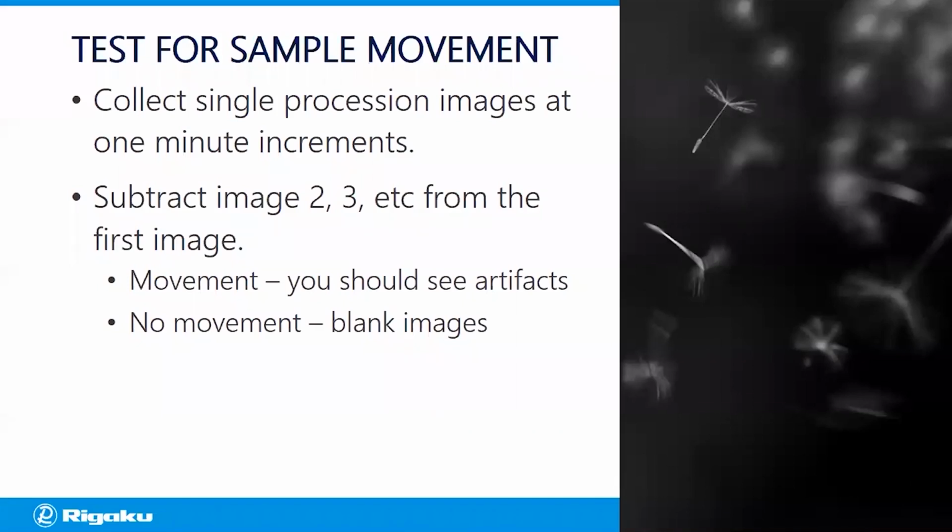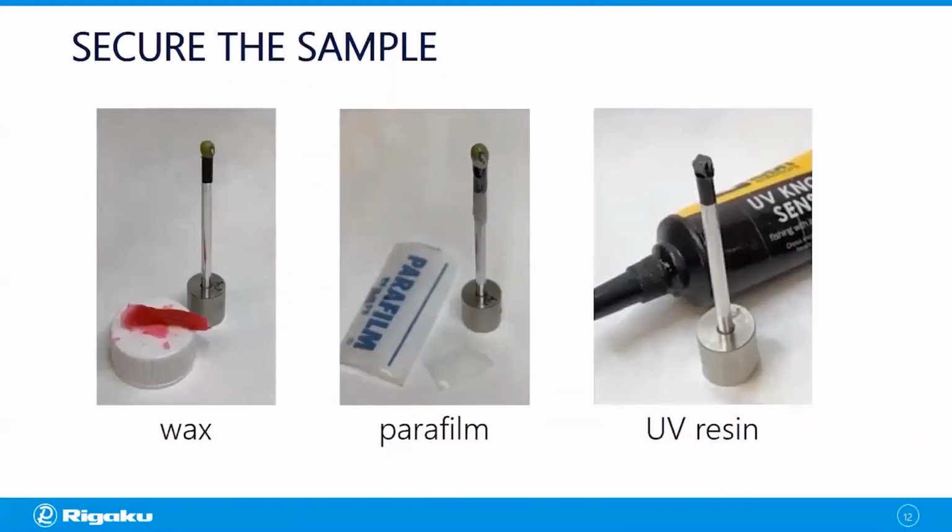It turns out this works great for some samples, especially for materials, which are usually hard samples, but it doesn't always work for plants. So in that case, what other options might we have? Your next consideration would be to evaluate how your sample is mounted during the imaging experiment. This slide shows a number of different tools we use in our imaging lab to secure samples.